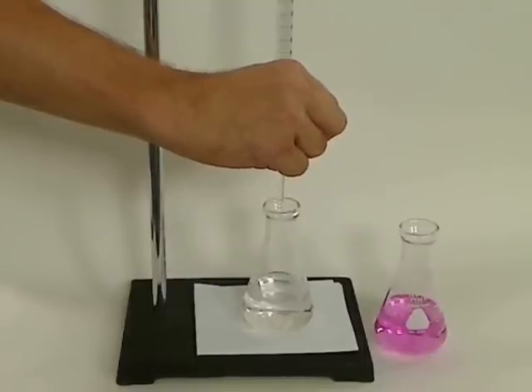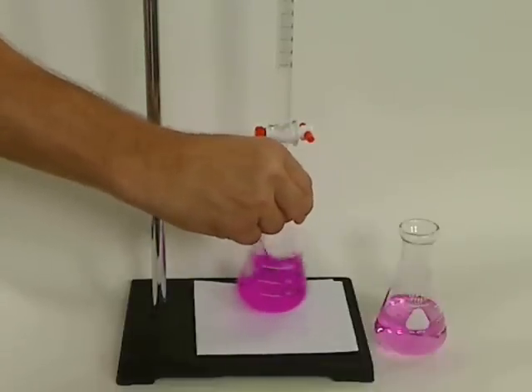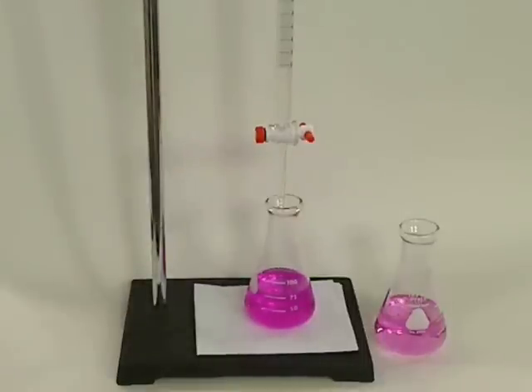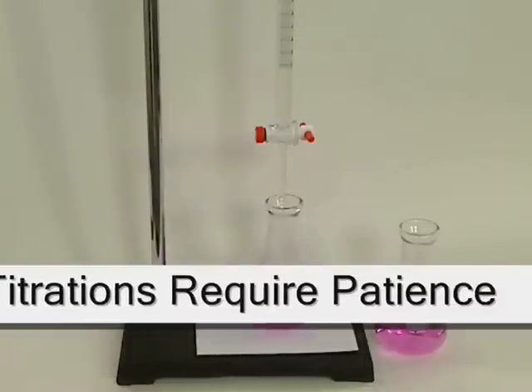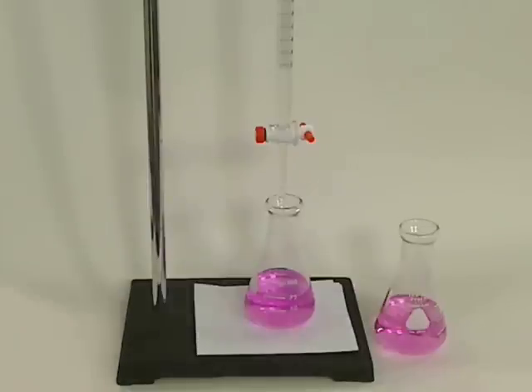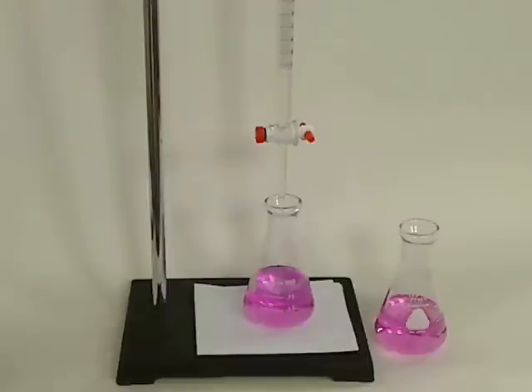I'll do another full drop here. In my haste, I probably overshot just by a tad, which brings me to the last point. Titration is all about patience — being very slow at the end, swirling, waiting for that color to stay and not disappear, and doing half drops. Titration is about patience.